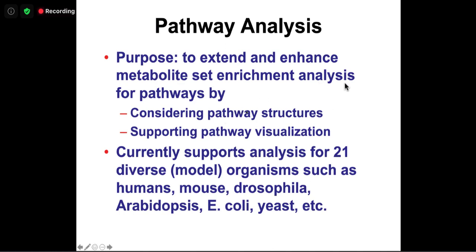So we support a structure and a visualization and help you see who's upstream, who's downstream. And currently supporting 21 organisms, I'm thinking about going to 23 now. We are gradually adding some organisms, mainly model species.